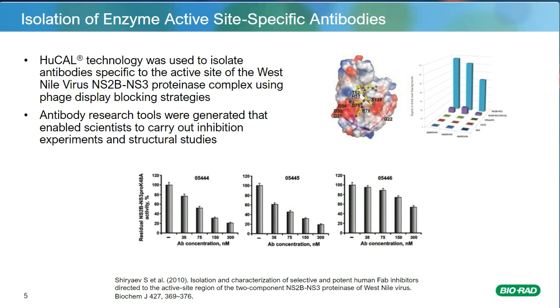You may have noticed in both this slide and the previous primate versus human example, we're targeting very small differences. And some of you may be thinking, would it not have been simpler to design peptides to an area of sequence difference and generate antibodies to these? We can and have successfully used peptides as antigens in our projects, but there are some caveats to using peptides in this way. Primarily, peptides are short, linear fragments and ultimately do not usually share the same native conformation seen with a protein antigen. Also, from our experience, it's shown that using peptides as antigens can result in a lower affinity antibody clone.